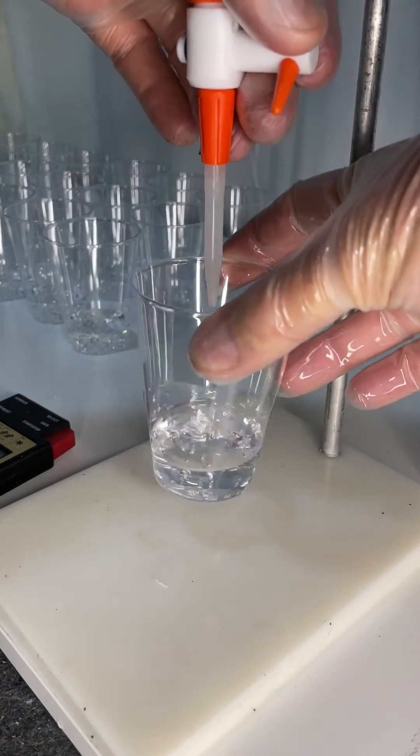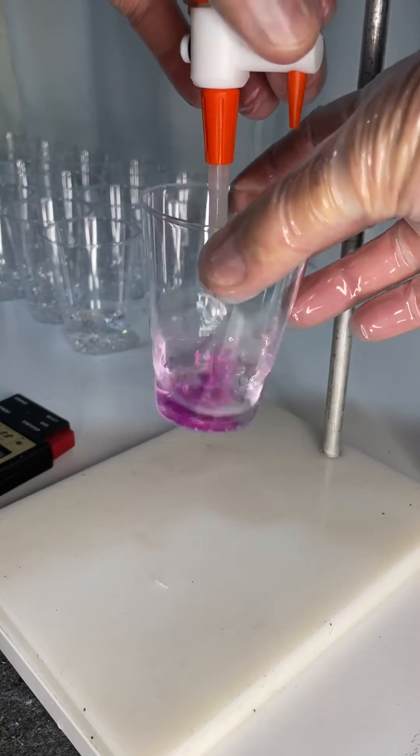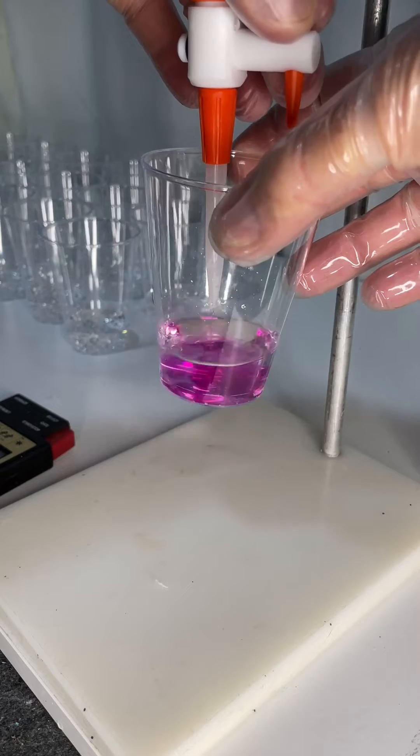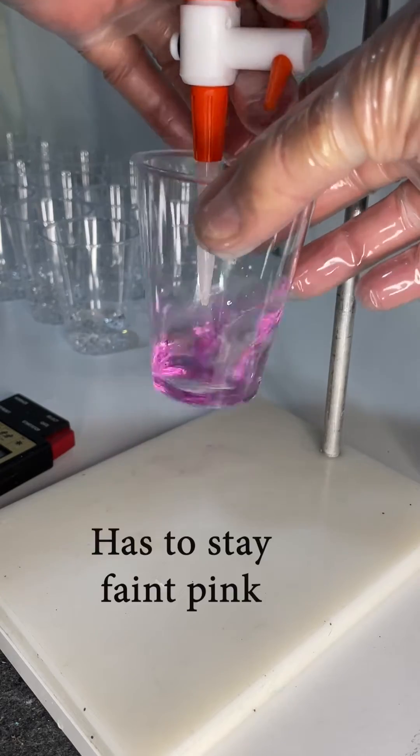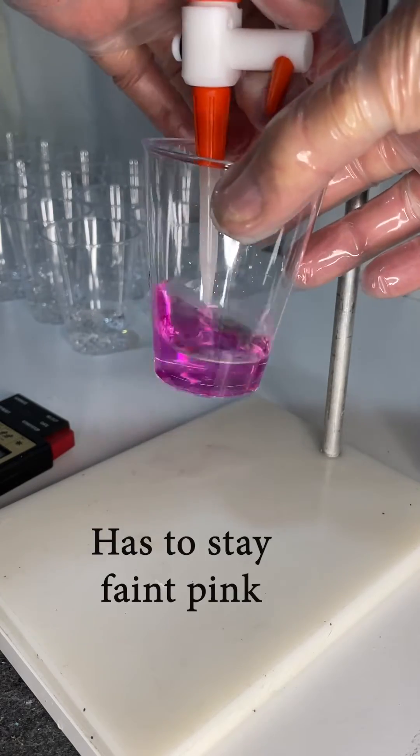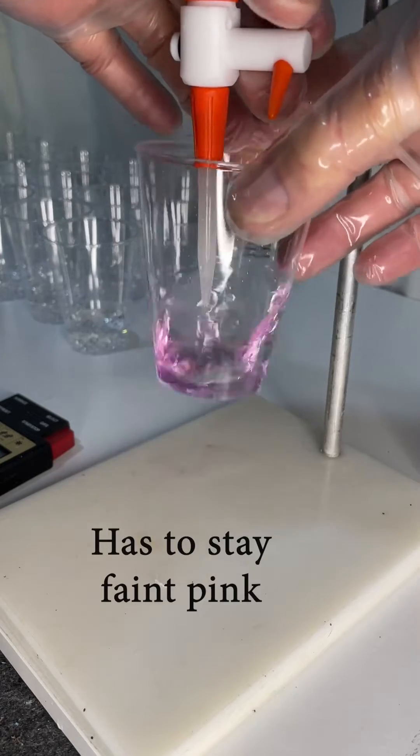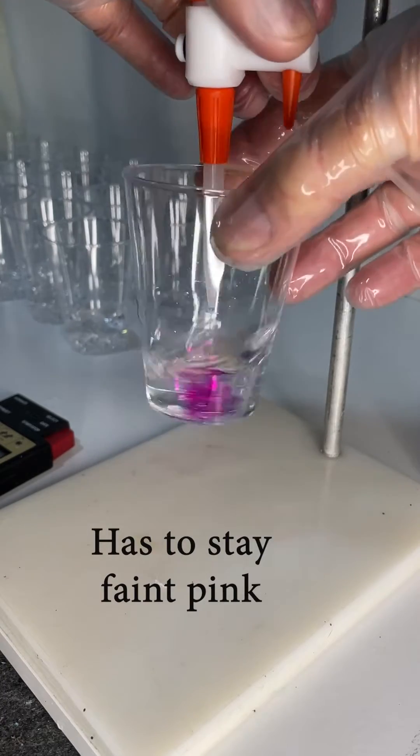In the video you can see I've added phenolphthalein to the container. That's just a plastic cup. I've got sodium hydroxide in the burette. Now at the endpoint you need a faint pink color to last for 30 seconds.